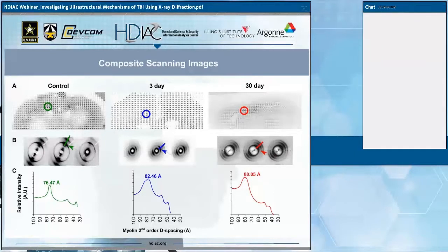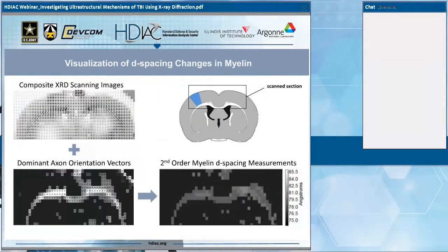And to characterize what kind of fixation method does what. And I'm very pleased to say that we were able to find that perfusion fixing of the organisms, as is used here, produced very small changes, the smallest changes we found of any fixing method, in the region of 5% or less, which was slightly smaller than the changes that we were observing. But most importantly, those changes were ubiquitous across the brain, whereas particular changes that we see in these images are located in particular areas. Could you go back to the previous slide?